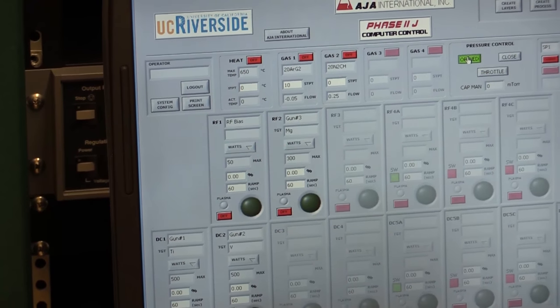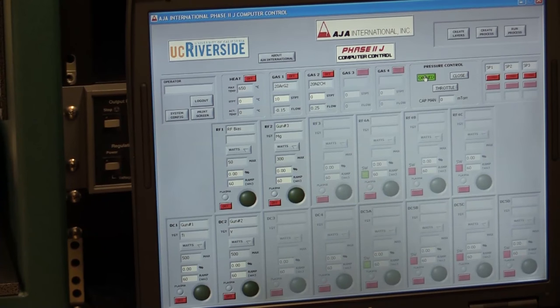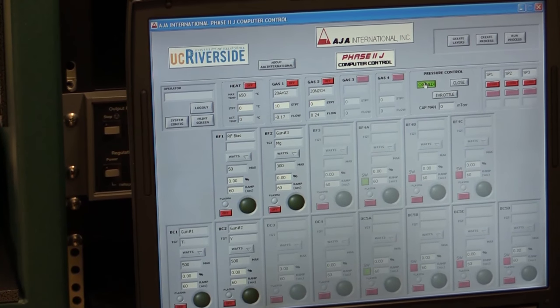At this point, our thin film is deposited and we need to reverse the loading process. When we're done reversing the loading process, we need to vent the load lock chamber.